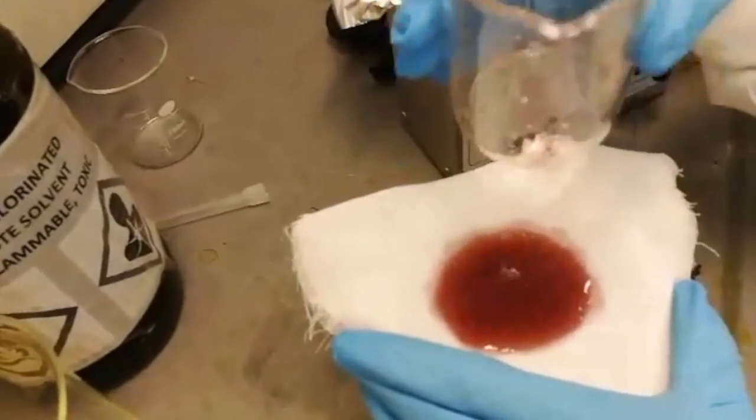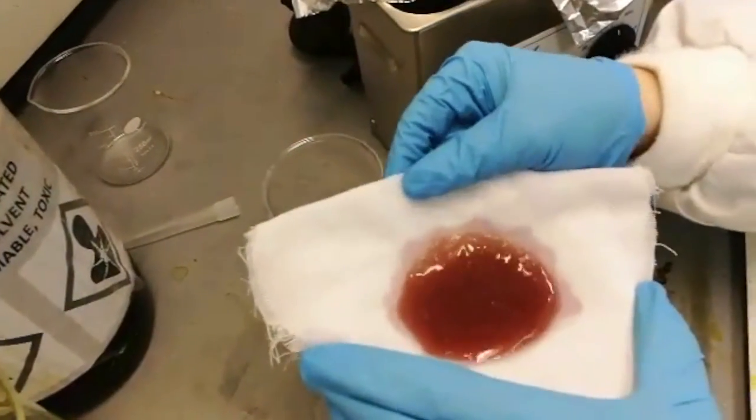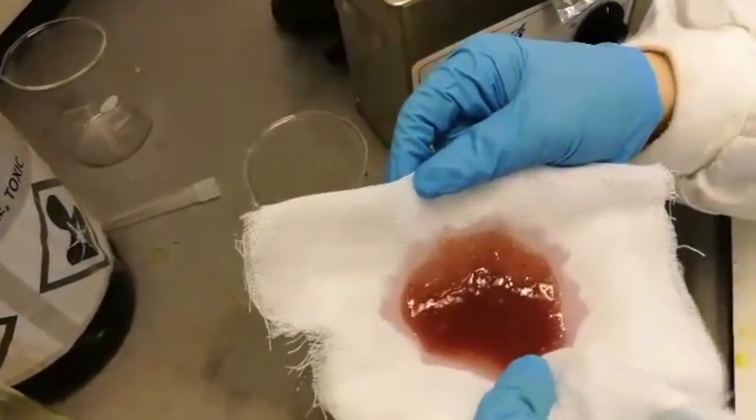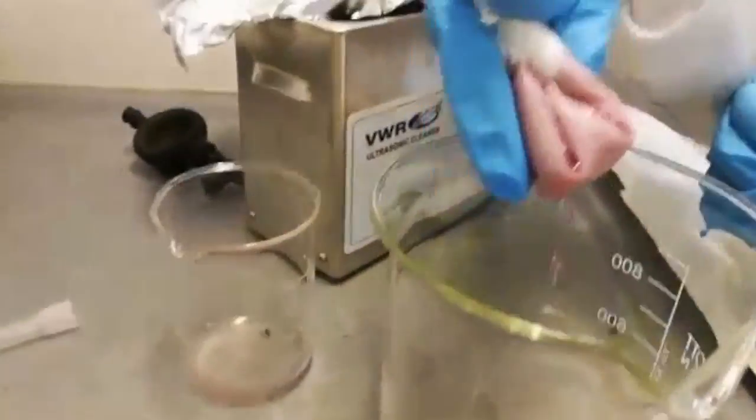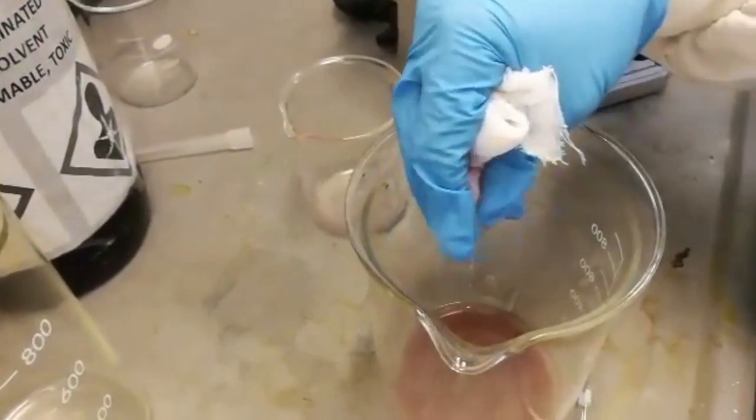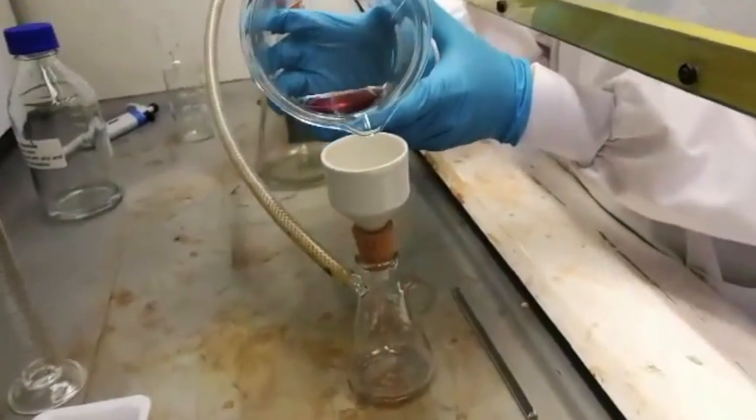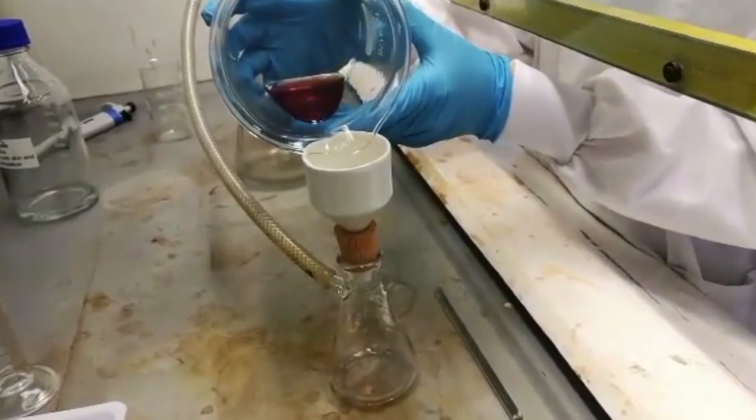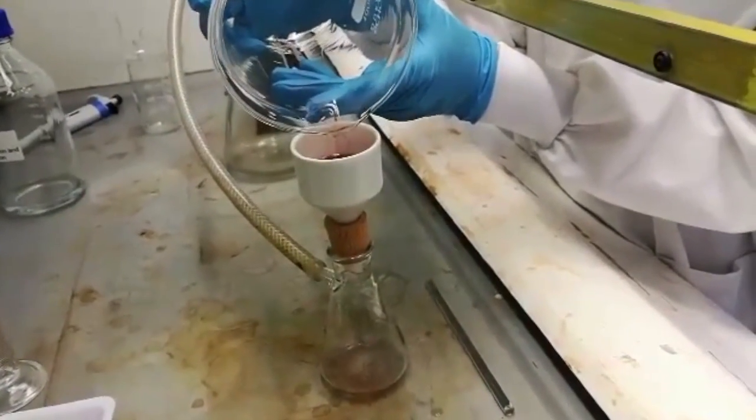After 15 minutes in the ultrasonic ice bath, the sample was filtered using a muslin cloth. This was used to remove larger particles from the sample before proceeding to use a finer filter. Next, we used the final filter to ensure smaller particles were removed from the sample.